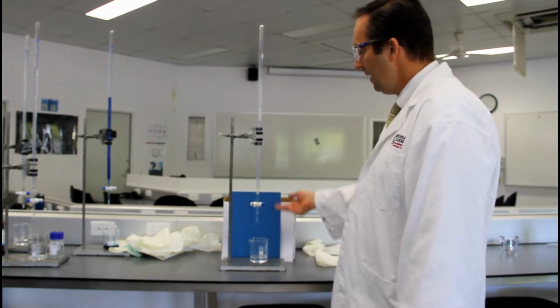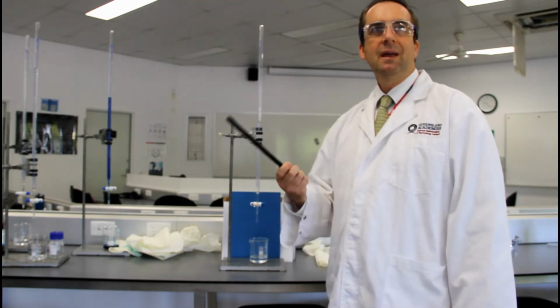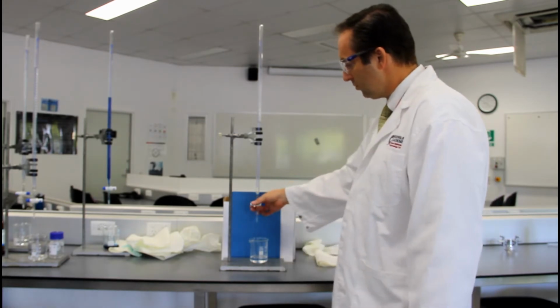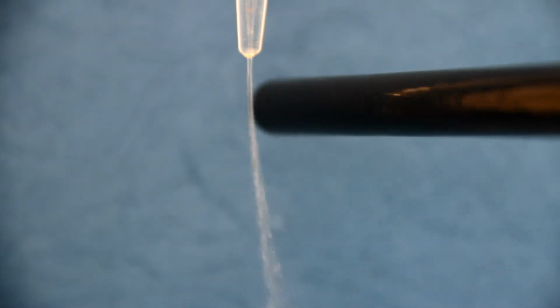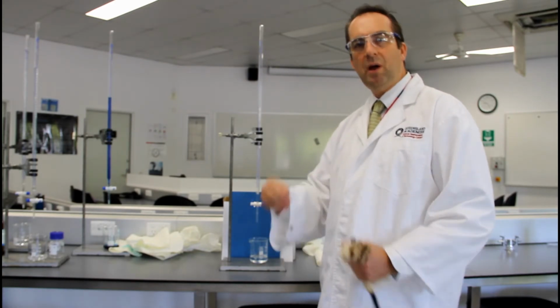Okay? And so what I will do now is I will set this up, and I will have the stream flowing here, and as I bring the charged rod close to the stream, we will see if the stream is affected by that. So I will do that now. So I turn on the stream of propanone, like that, and then I charge up the rod, and as I bring the rod close to that stream, you can see that it moves. Now, it doesn't move a huge amount, but it definitely moves a little bit. So it is attracted to the charged rod.